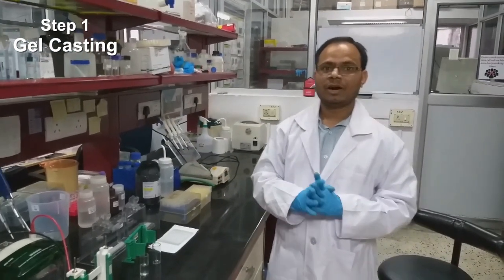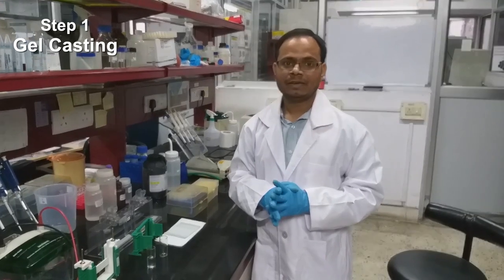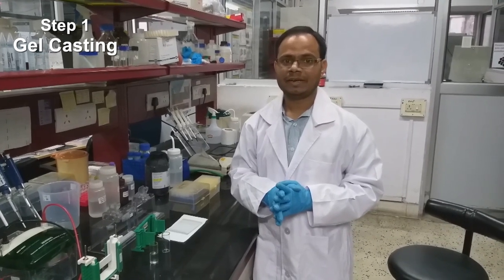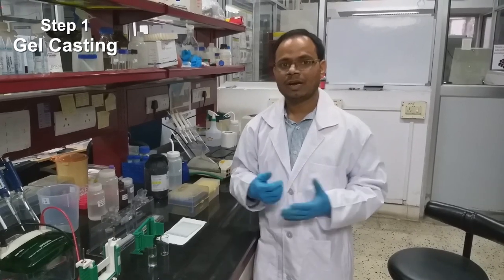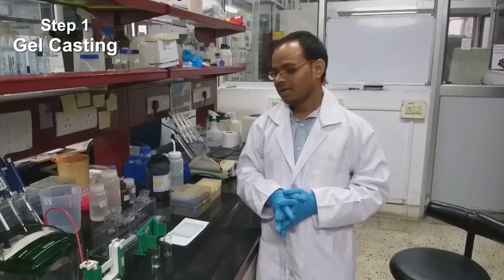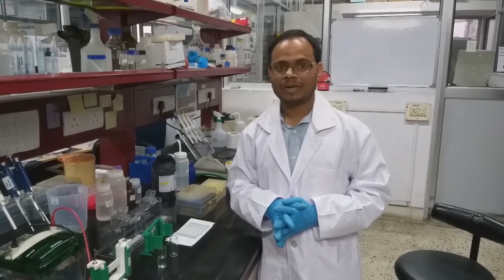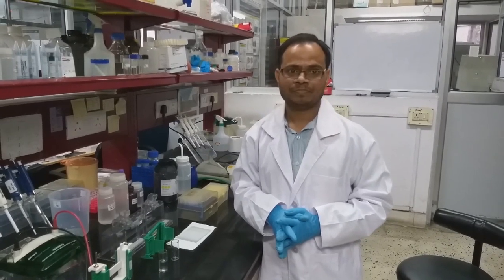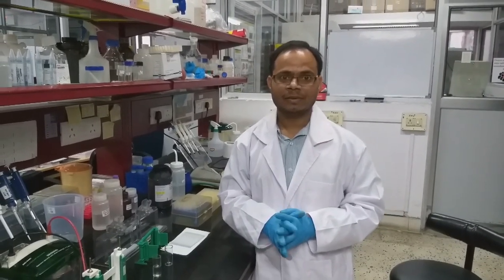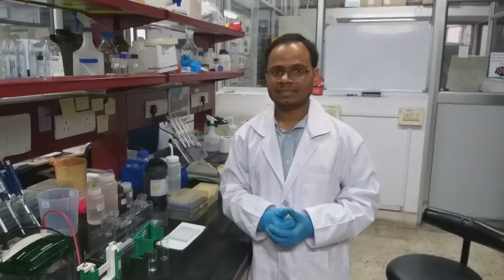After this, we have to prepare the resolving gel. For the resolving gel, we need 1.5 molar Tris HCl pH 8.8. In addition to that, we also need 10% SDS prepared in double distilled water, and also 10% ammonium persulfate and TEMED. The role of the ammonium persulfate and TEMED we can see during preparation of the gel. They act as a catalyst.